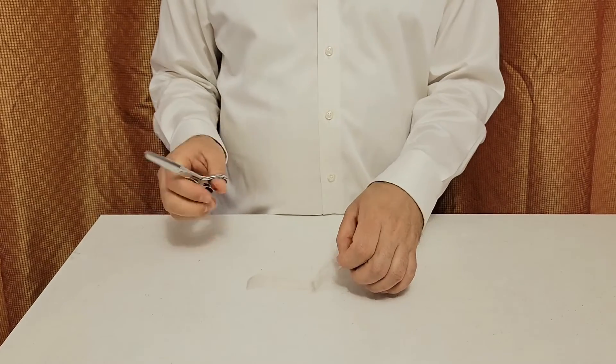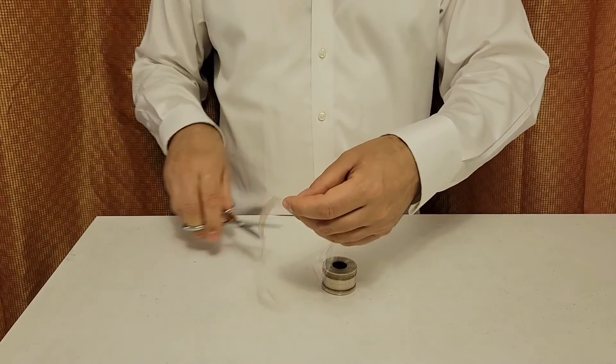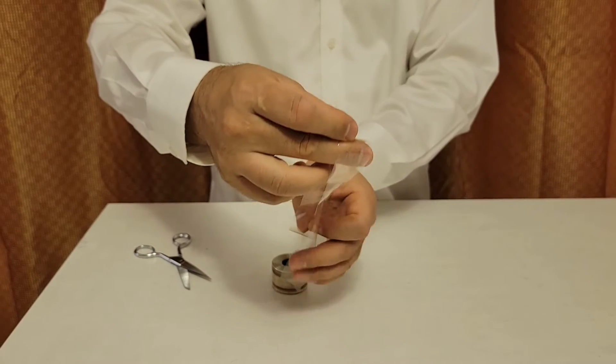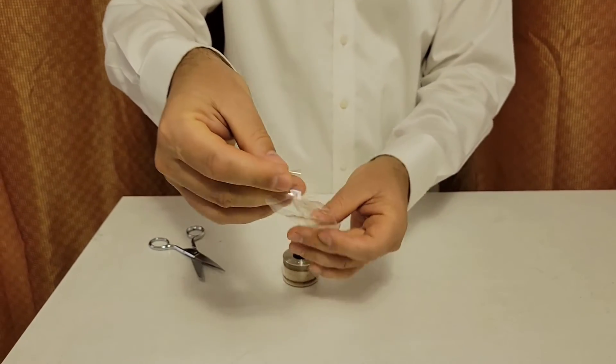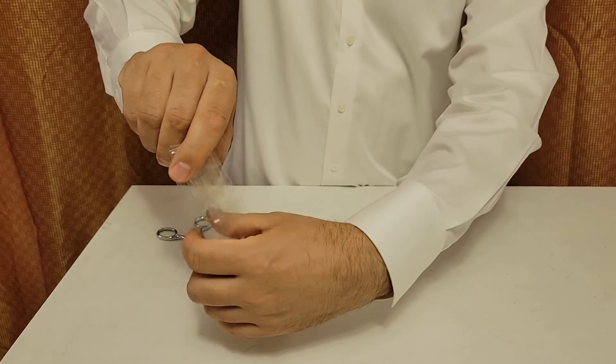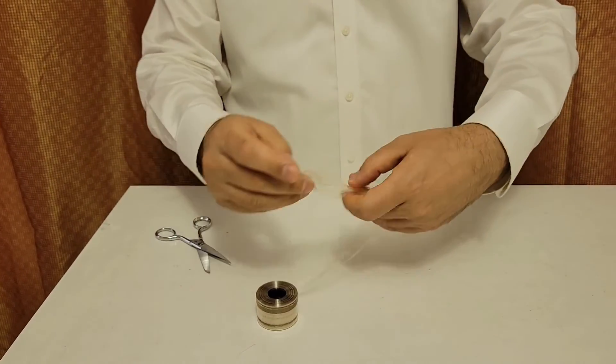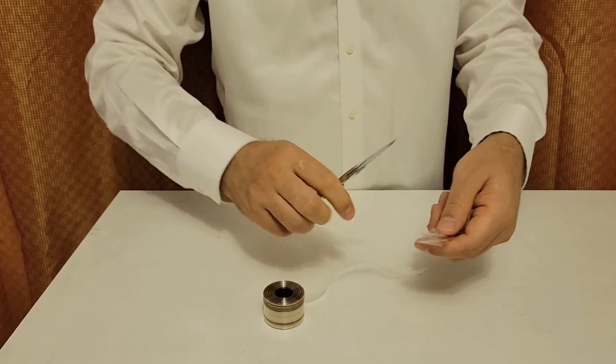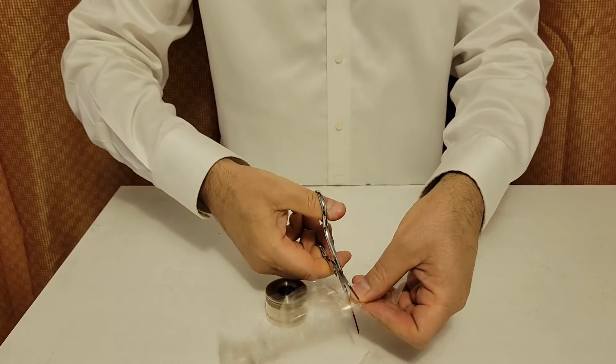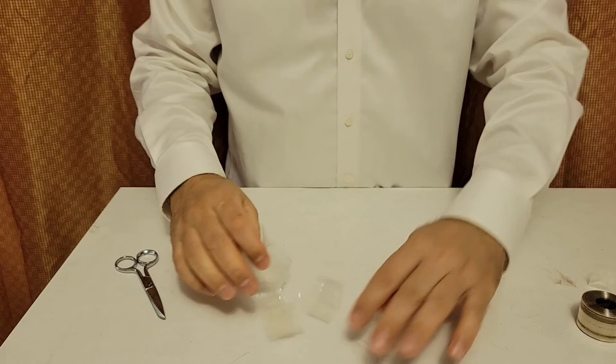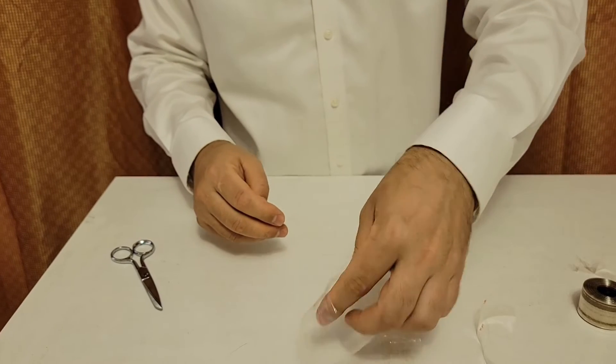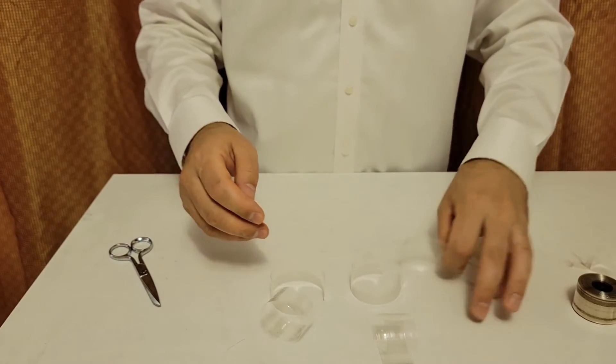So instead of cutting dialysis tube one by one, you can simply use this trick by folding the dialysis tube one, two, three, four times and cut it at once on one end and on another end. Here we have five dialysis tubes: one, two, three, four, five.